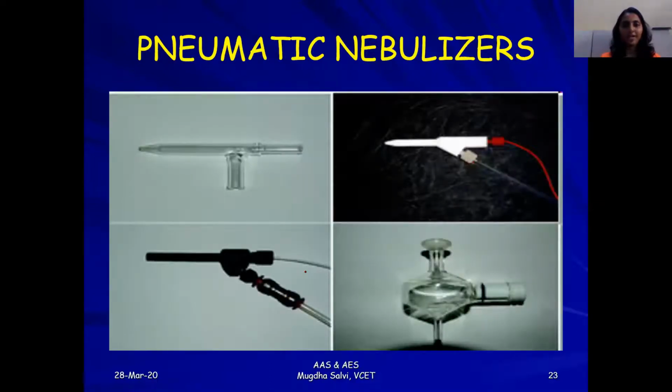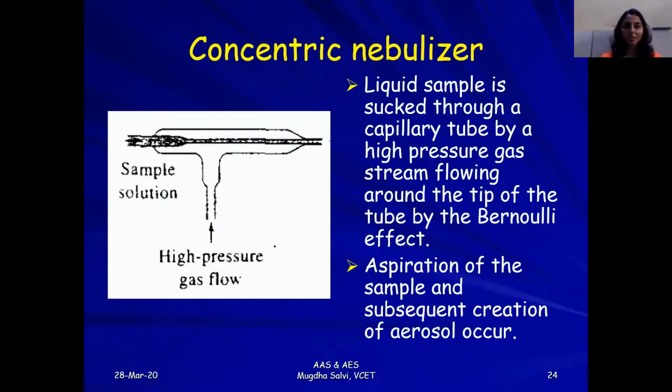So this is actually how these nebulizers look. You might be reminded of the pichkaris from Holi time. This is what a nebulizer actually does sometimes. It is going to spray your sample into a very fine mist. So if you see this, this one is a better diagram.